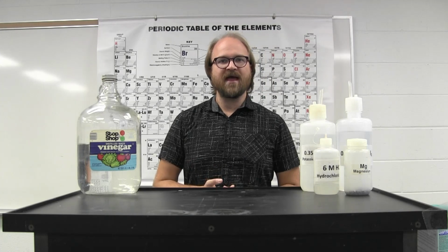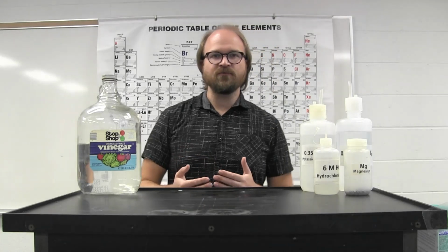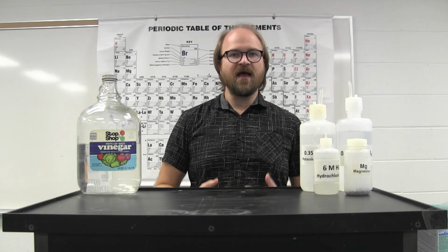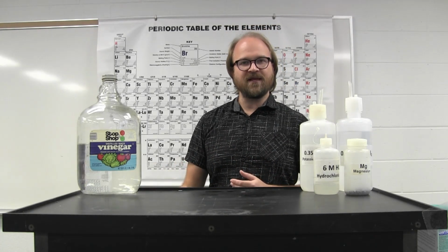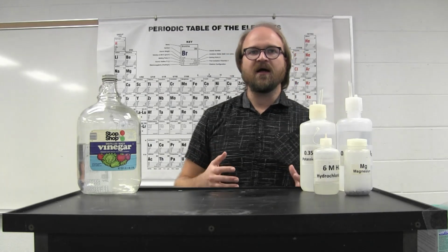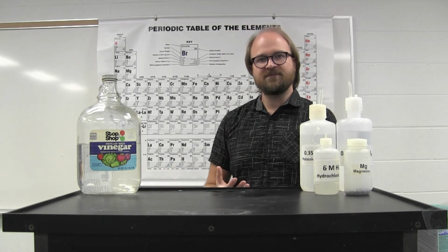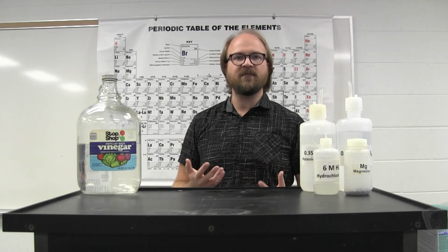The second part of the experiment is that video, looking at precipitation reactions and going through and experimentally determining what is the limiting reactant, as well as calculating the amount of limiting reactant and figuring out through calculations how a limiting reactant can be chosen, and seeing the overall theoretical yield of a reaction, which is based on the limiting reactant.